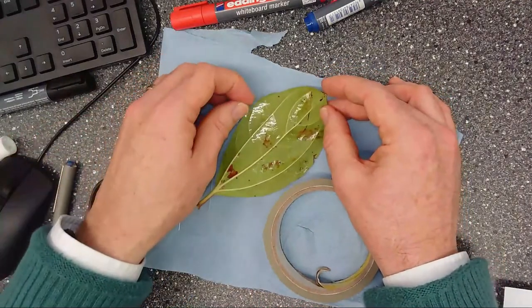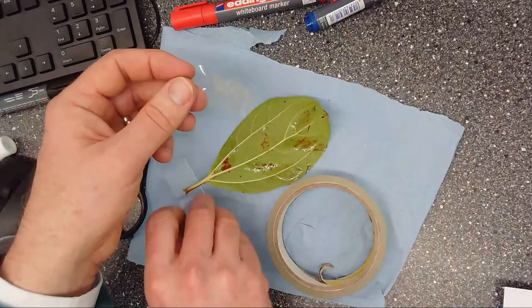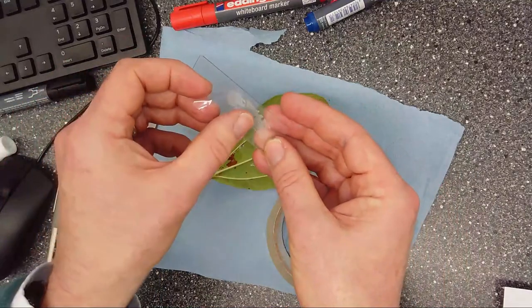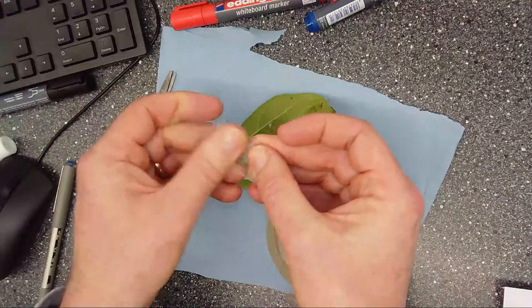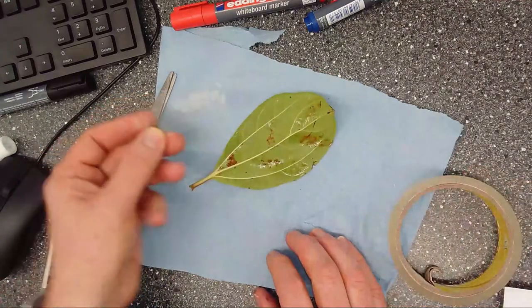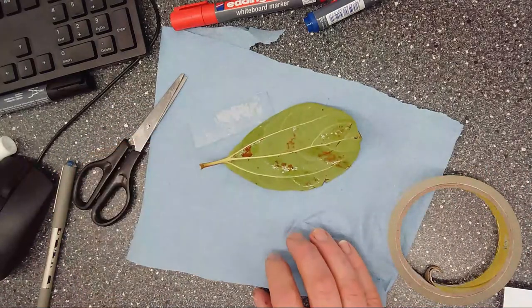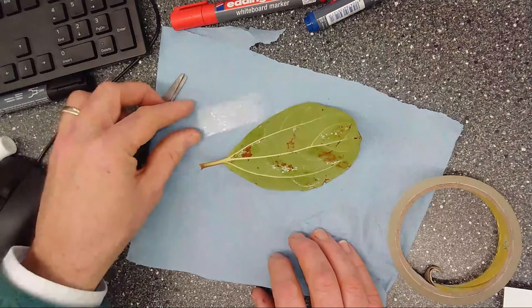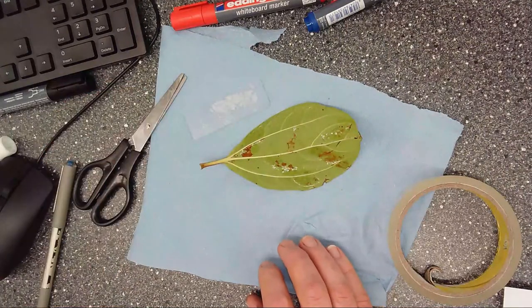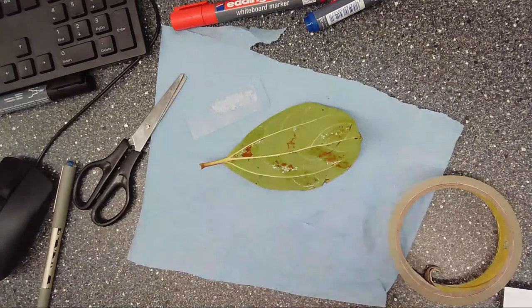Then lightly take the sellotape off, and you'll have your print there, and you can place it on the slide like that. You can see it's an imprint of the leaf. Then you're going to place it under a microscope at low magnification, and then increase the magnification. What I'd like you to do is see if you can find a group of stomata. I'm going to set one up as well here so I can show you through the visualiser.